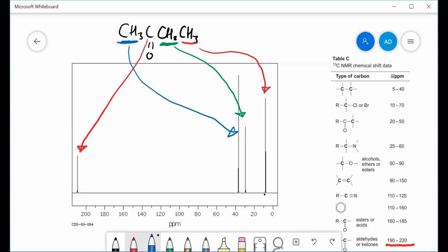Once again, you can see with the heights of the peaks, they should all be the same because you've got the same abundance of carbon atoms there. They're not. So that would suggest the integrated value isn't reliable.